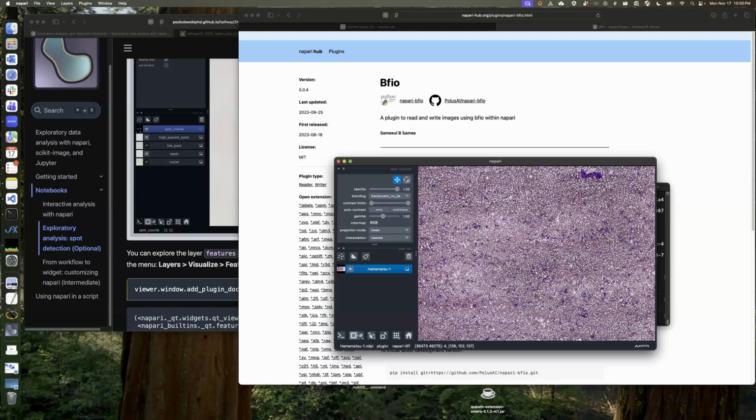And then everything you do here, this canvas, is sent to your GPU using OpenGL. So a 40 gigabyte file is not going to fit on your GPU memory unless you have like an NVIDIA A100 or something. So what Napari does is it will only send a portion of the image to the GPU. And so for large 2D images, the pyramidal approach works really, really well, and it's quite performant. OME-Zarrs and things like that are the ideal way to handle those kinds of large files.